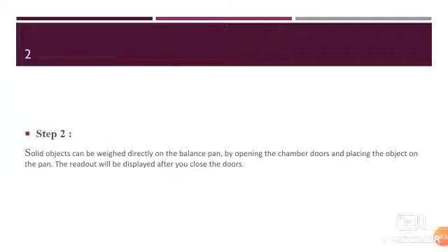Step number two: solid objects can be weighed directly on the balance pan by opening the chamber doors and placing the object on the pan. The readout will be displayed after you close the doors.